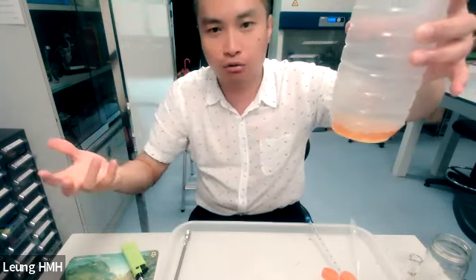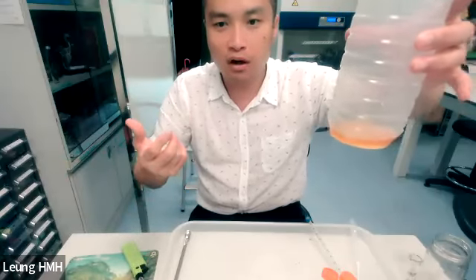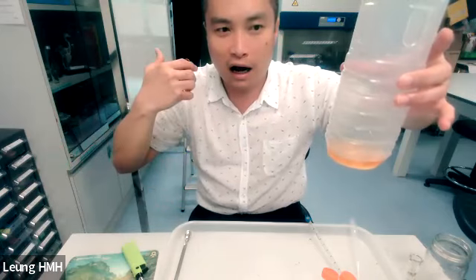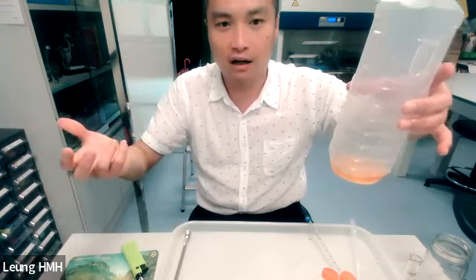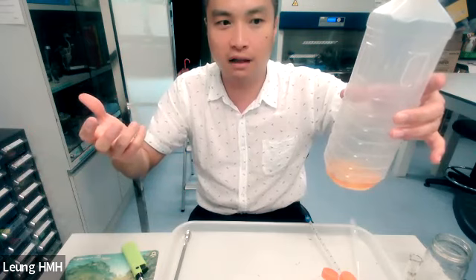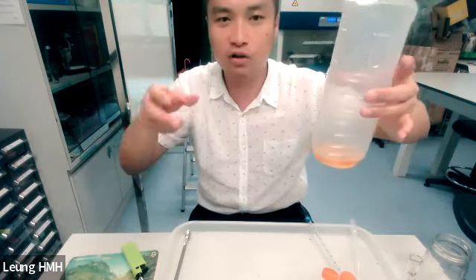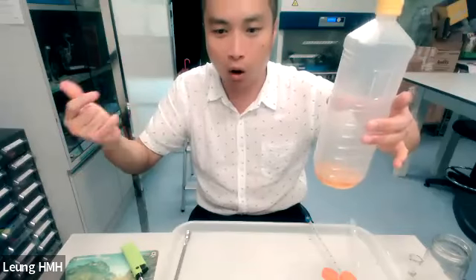In biodiesel, the critical point is that we try to remove soap from the biodiesel. It's very difficult, right? If there is more contaminant such as water, it will further lower the performance of the biodiesel. So it is better to eliminate or minimize contaminants such as water.